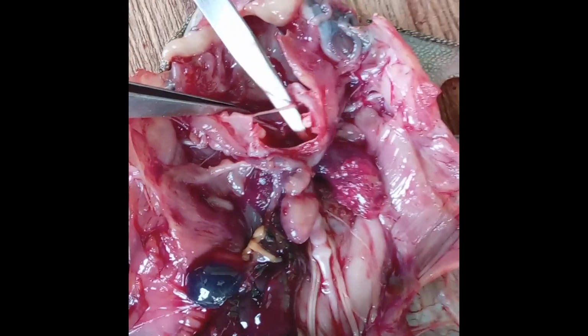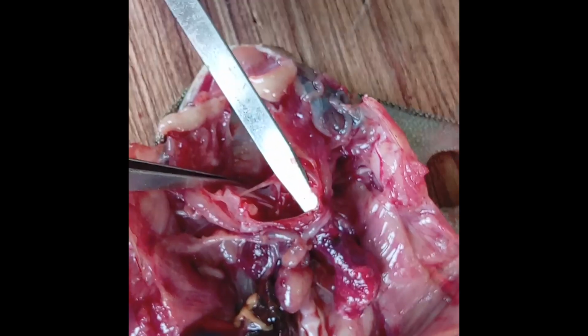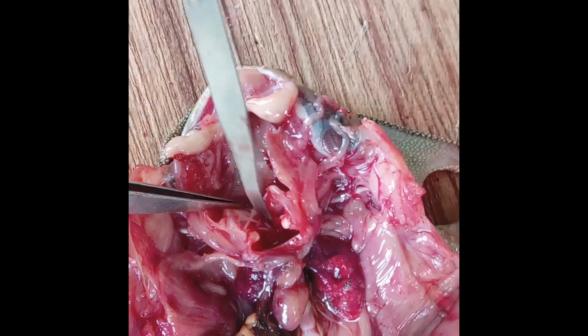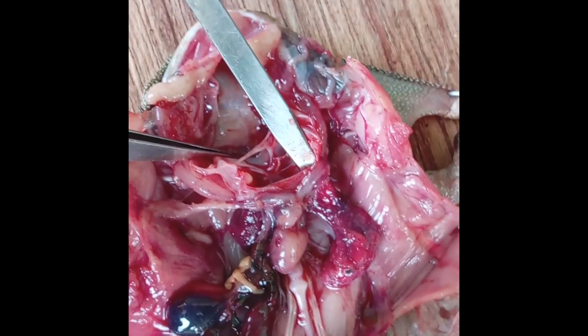That's the left lung. When air is pushed out of this lung, it affects the structures to cause sound to be made. So air is pushed from the lungs, and it will make the structures in the chamber make sound.